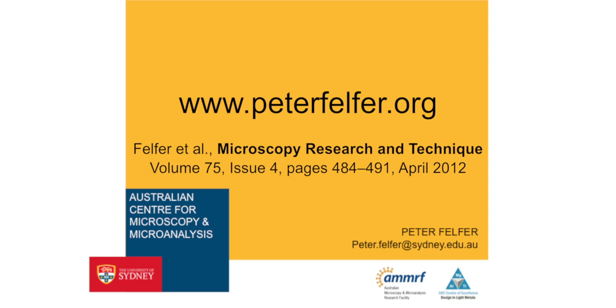Most of the things that I've said here, you'll be able to find in a paper that I published last year. In that paper, I mainly tried to focus on the things that people have been asking me quite a lot when they were contacting me about how to make their samples. So it's more about what influence certain ion beam settings have on the geometry of your samples. How do the welds work?